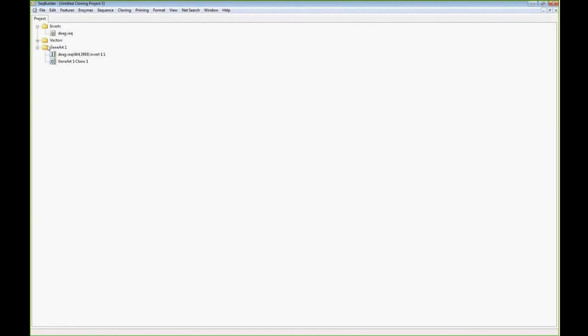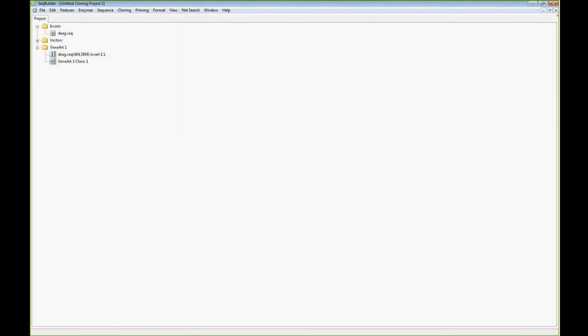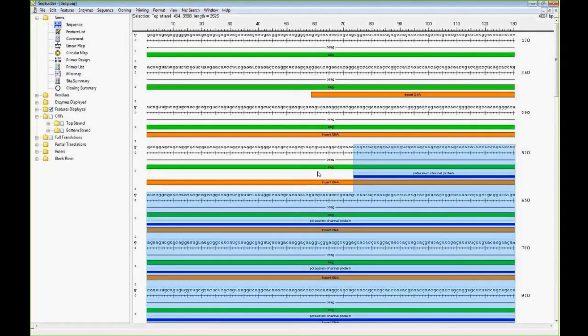All right. So let's kind of take a look at what we've done with the traditional enzyme digests. Historically, in our software, you previously would have had to prepare your target, amplify the correct primers, 5' and 3' on your target, open another file of the expression vector, and then basically clone that restriction insert into that expression vector of interest to make sure all the restriction sites map up. What we've done is we've automated that whole process entirely as well. So I'm going to close out of this project here, and then we'll go back to that potassium channel protein.